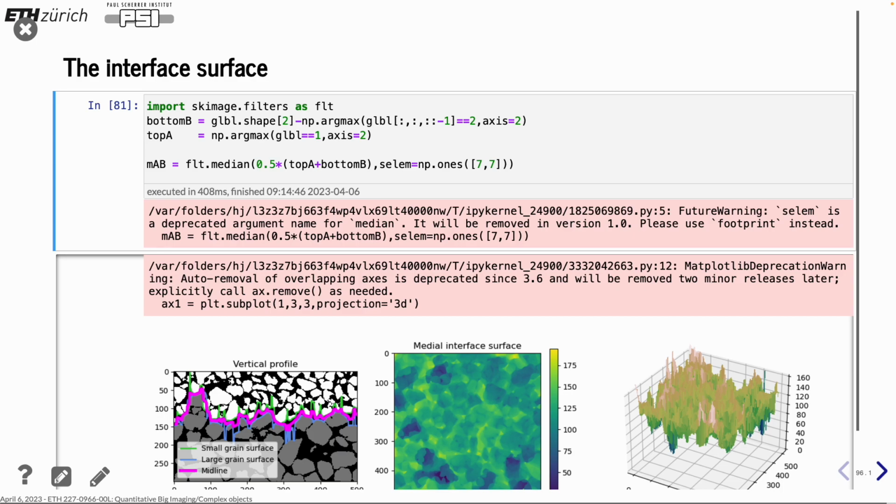So if you have, yeah, I think I can show it on this one actually. You can see that the green line goes up because there is a large pore here, and that gives you quite a spike. And also the blue ones, they go down all the way through here, and that gives you a spike in the other region. That is the reason why you get this spiky profile between the two layers.